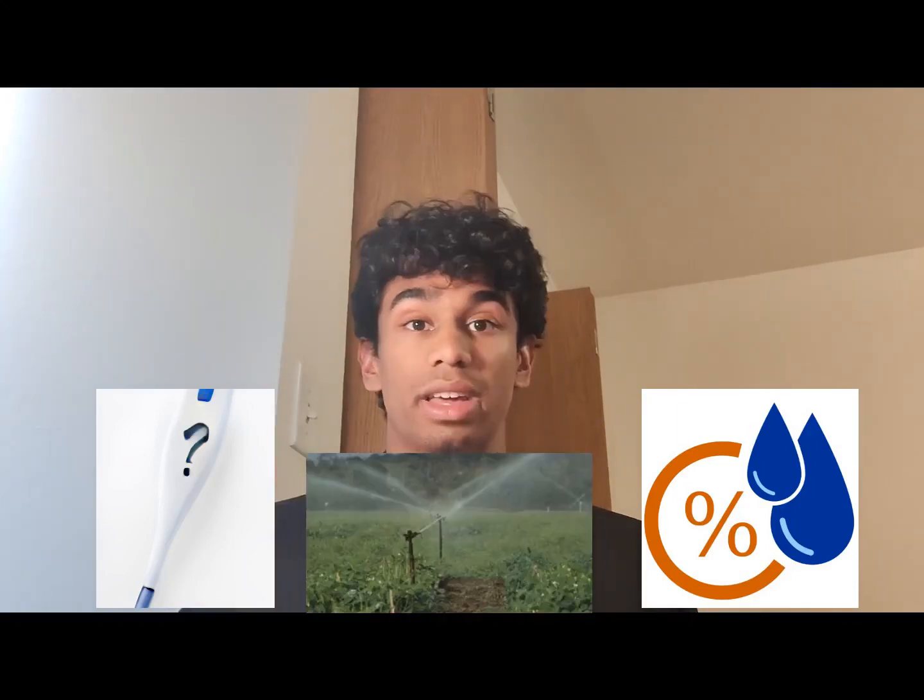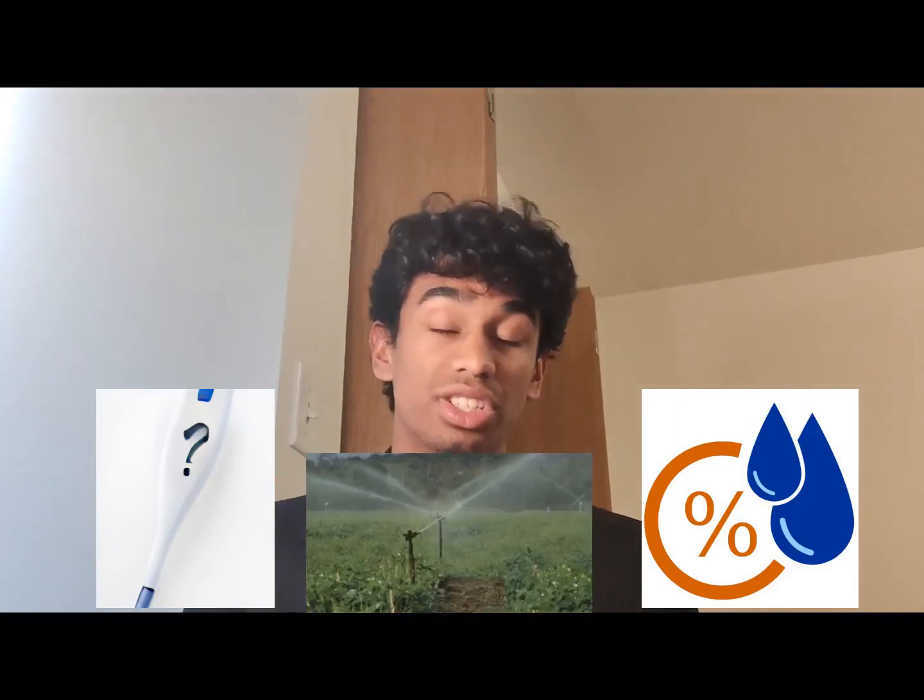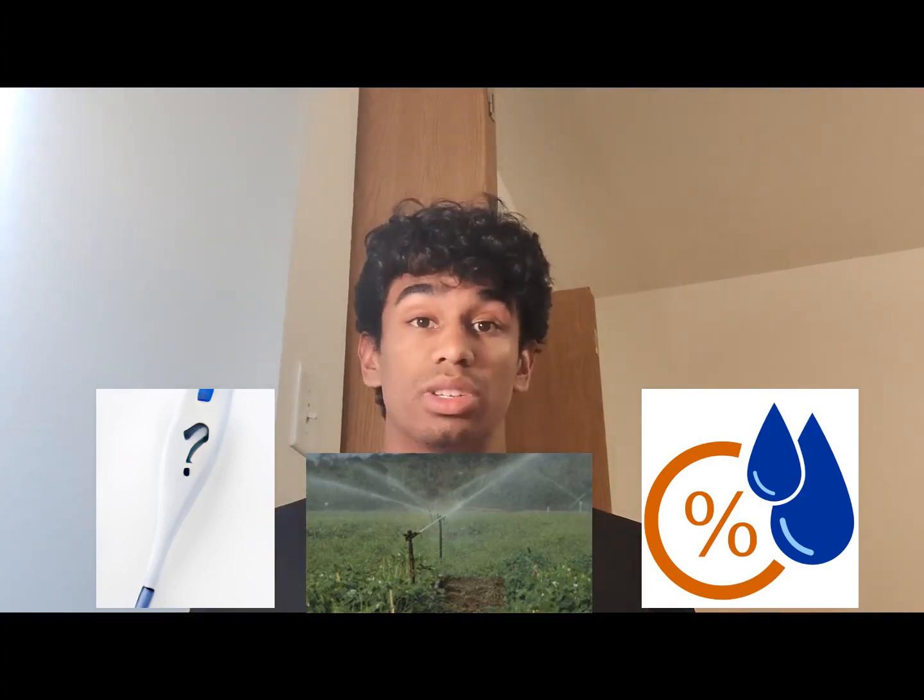And then after you cross-pollinate and get the seeds ready, your offspring, you can plant these seeds and have them grow in the actual growth chamber, which is also useful in breeding, because growing them in the growth chamber will provide the best possible temperature, humidity, and irrigation, and you can monitor them at all times.